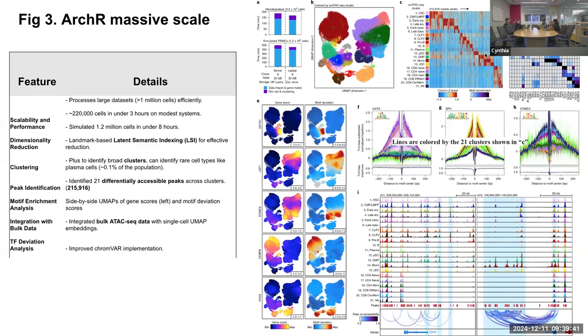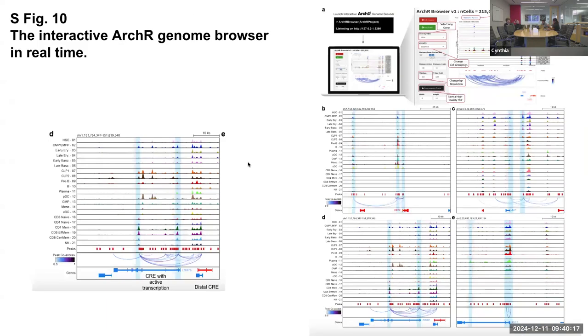And they can also make visualizations of the gene scores against the motif enrichment, so they can present these correlations against the different clusters identified, which are present here in the y-axis regarding the motif enrichment that they can find. And well, the data indeed can be integrated with other data types, like single cell RNA-seq data.